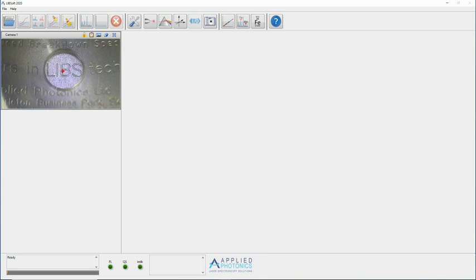Each time LibSoft is started, the crosshair position is initially locked so that it can't be moved accidentally. To unlock it, click on the padlock icon in the title bar of the display window. To reposition the crosshair, hold down the Shift key and then right-click on the image at the required position.